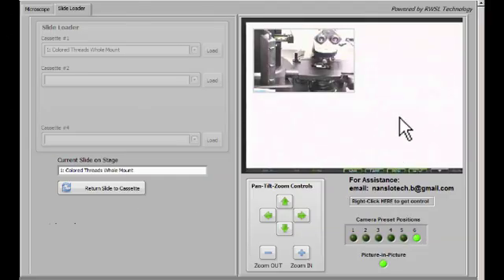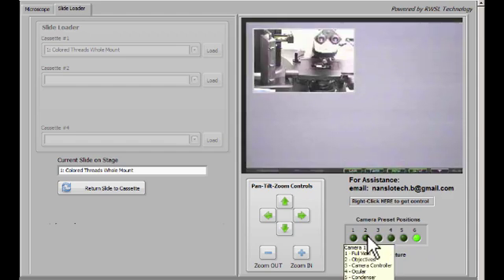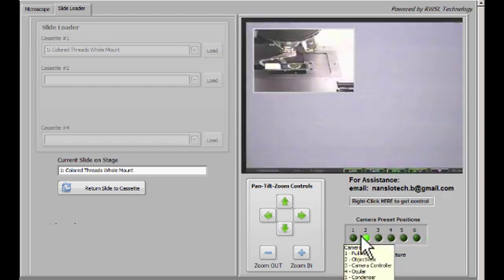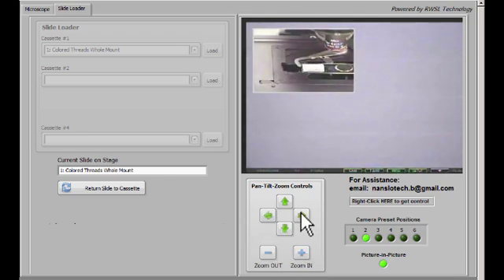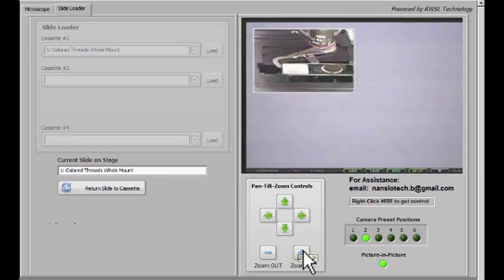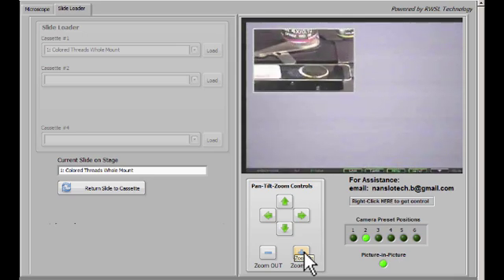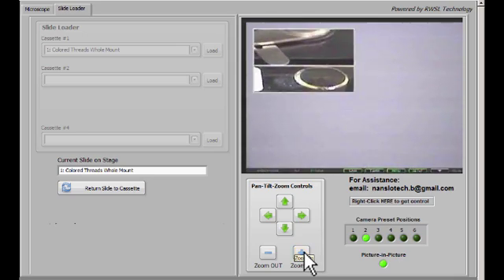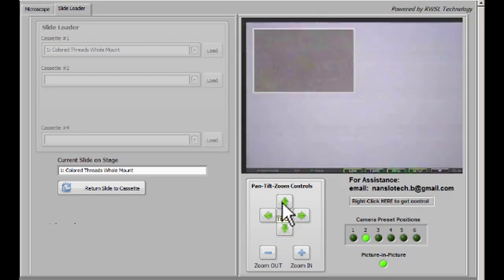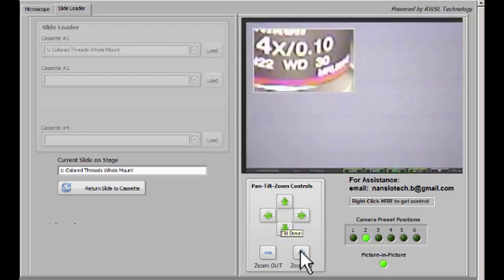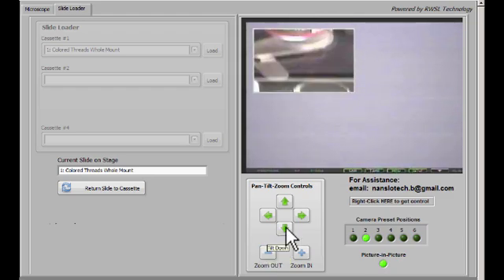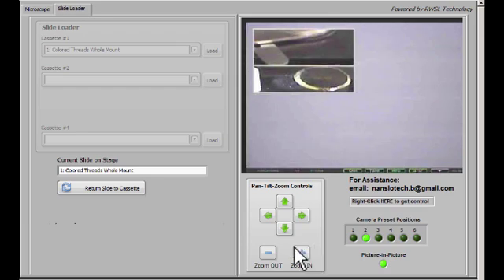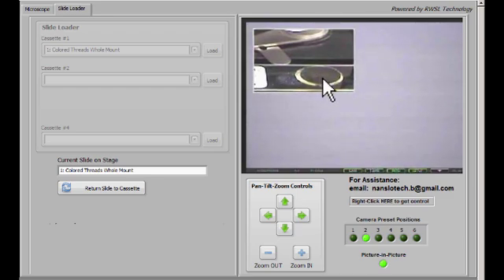A problem that often occurs when loading a slide is that it will be loaded, but there will be nothing directly under the objective, so you can't see anything. If you'll click on Preset 2 and enable the Picture in Picture camera, you can zoom in closely on the slide that's on the stage. In this case, we can see that the subject on the slide that we're supposed to be looking at is not underneath the objective of the microscope itself. So what we'll do is we'll use this to guide us as we move the stage to get that subject underneath the objective so we can see it.